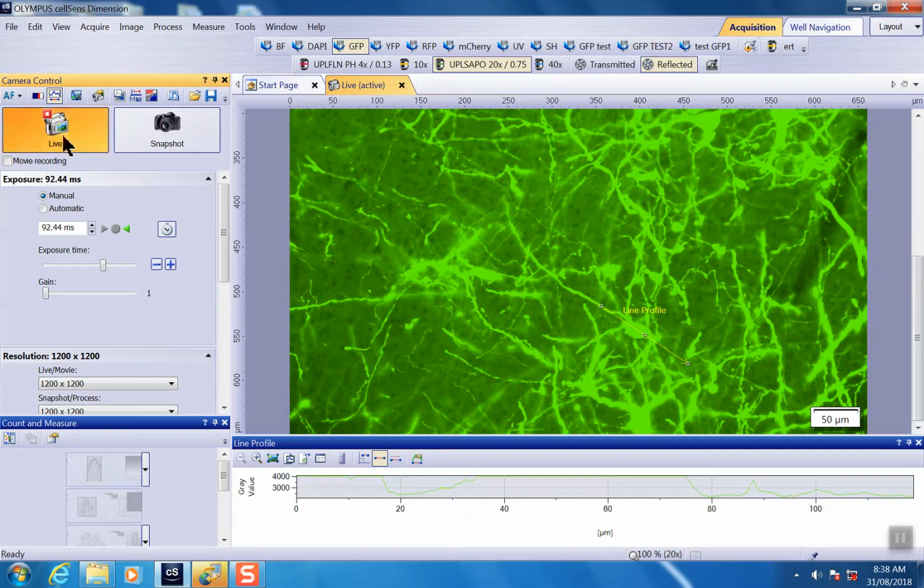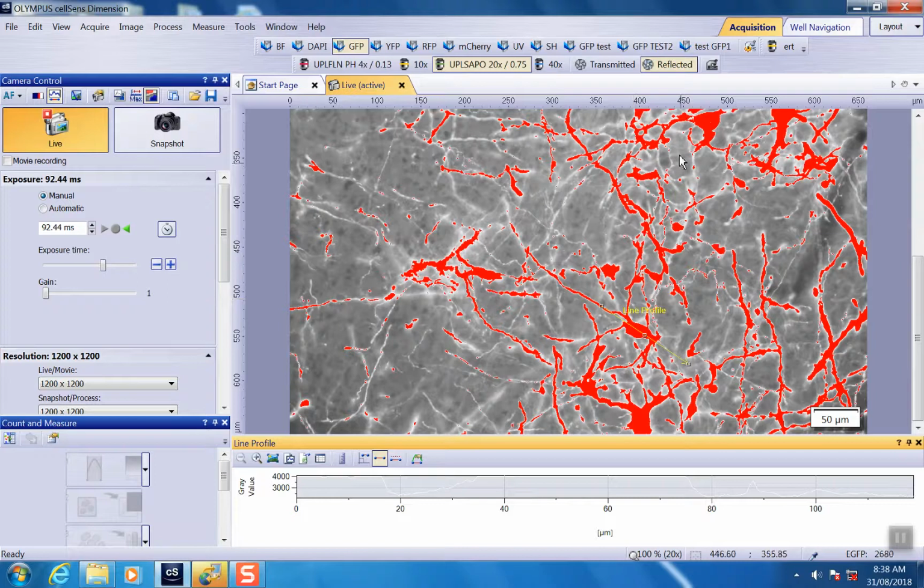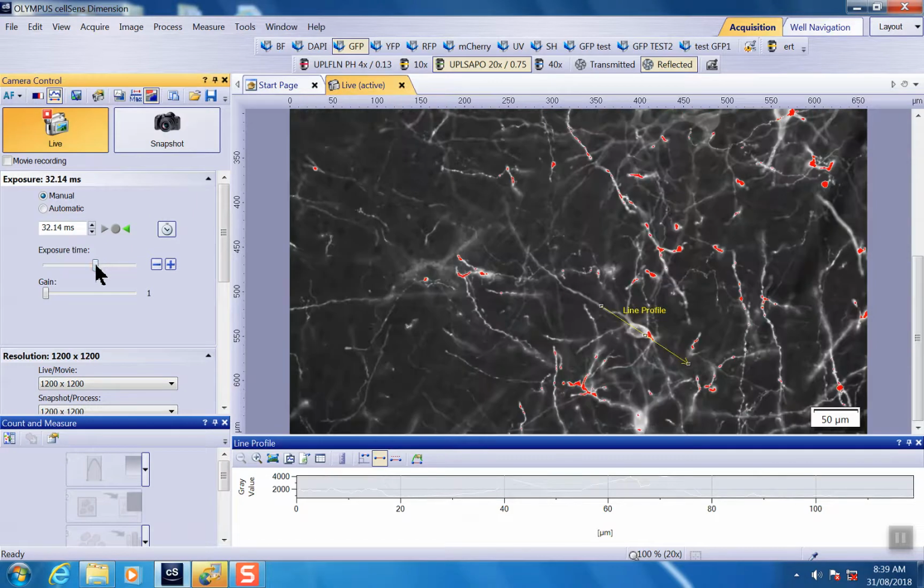Another way to see the saturation, you can use the high-low, or they call it the saturation indicator. If you click on it, you can see a lot of red. It means the grey value is way beyond the bit depth of your camera, so you won't be able to differentiate in the red area with any sort of detail. So you better adjust it down.